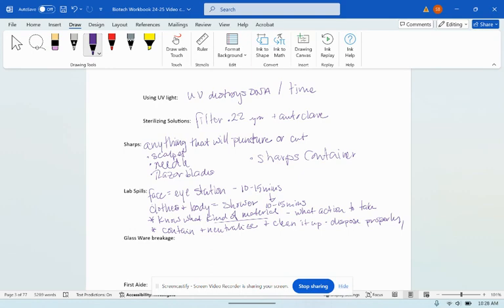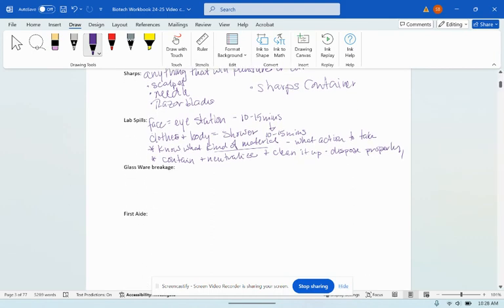Okay? Glassware and breakage. So if we have anything that is broken glassware, the very first thing you do is call me over. Call me over as soon as you see something is broken. Okay? We want to keep people clear.